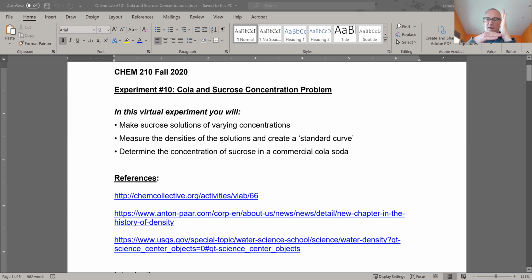Does it look like I fixed the solution, Francis? What's on the x axis? What am I plotting? Volume. X is volume. Could be volume. What else could it be? Like Ariana said, it could be concentration. So it could be volume, could be concentration. But what am I really getting at? You measure something, so you plot the measurement against something else. I'm trying to figure out a way to put it that doesn't give it completely away. What sort of things, volume, concentration, what do those two things have in common?